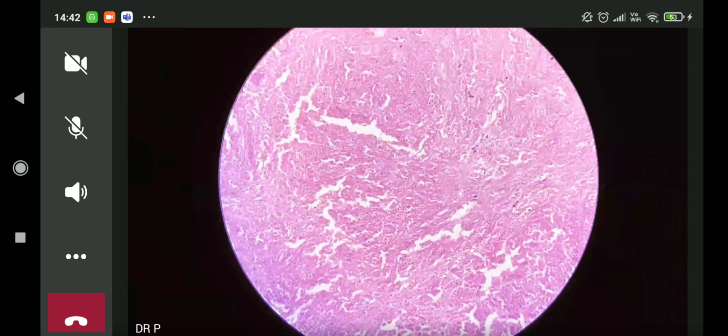Anyway, yeah, so someone said that there's apoptosis over here. So you're coming closer to what the actual pathology is. Anyone else? So we have one necrosis, which is fantastic. What's your name? Who said necrosis deserves a chocolate?